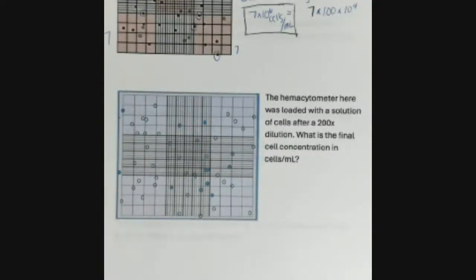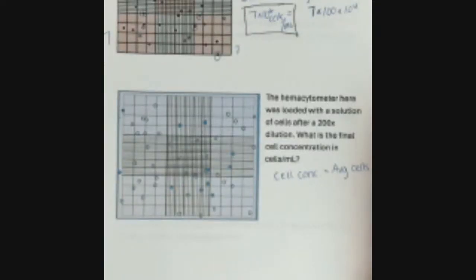So again, on this one, there's the filled in cells and the unfilled in cells, and you can just count total number of cells. All right.